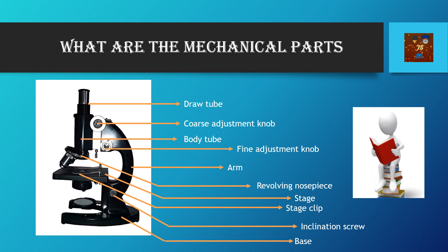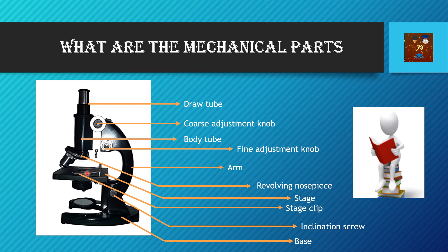First of all, let us look at what the different mechanical parts are. From the very beginning, this is the draw tube, then this round one is the coarse adjustment screw. Just after the draw tube comes the body tube, then the fine adjustment screw is below the coarse adjustment one. This slanting part is the arm, and this one is the revolving nose piece.